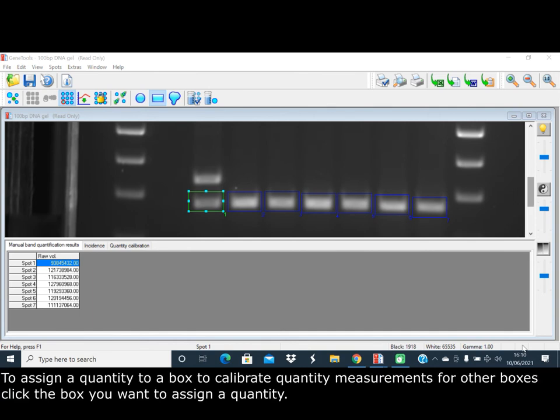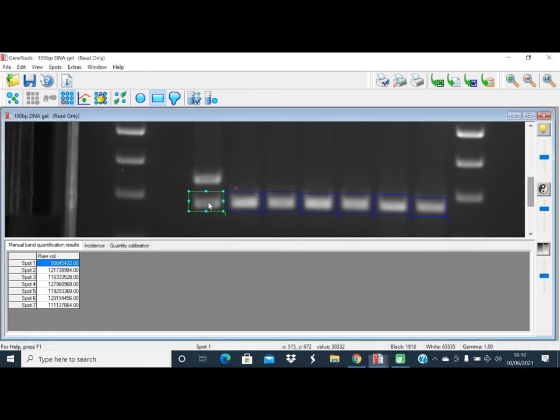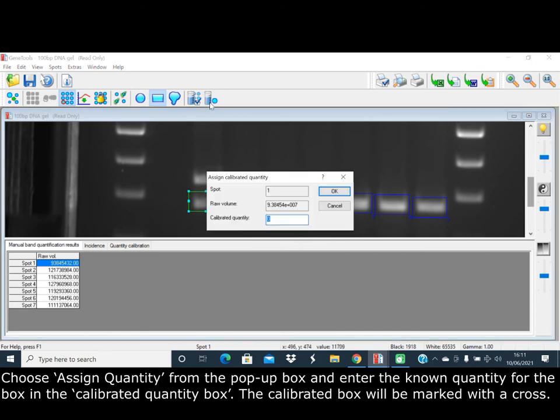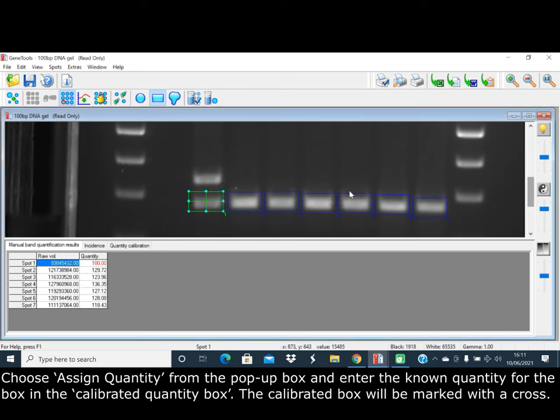To assign a quantity to a box to calibrate quantity measurements for other boxes, click the box you want to assign a quantity, then choose assign quantity. From the pop-up box, enter the known quantity for the box in the calibrated quantity box. The calibrated box has been marked with a cross.